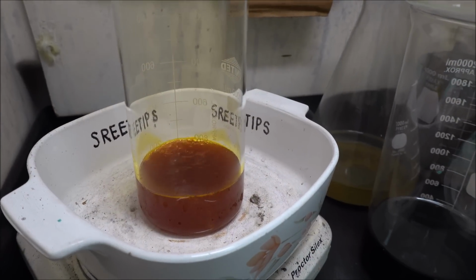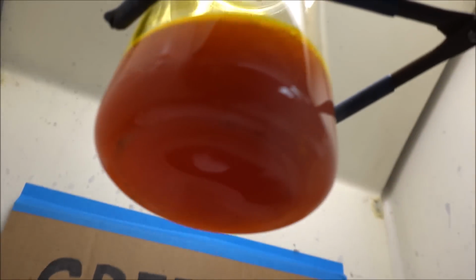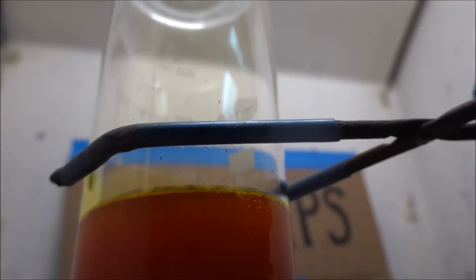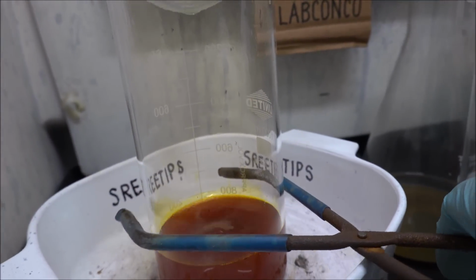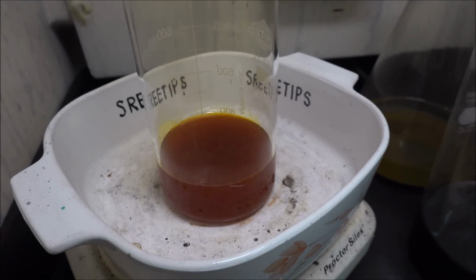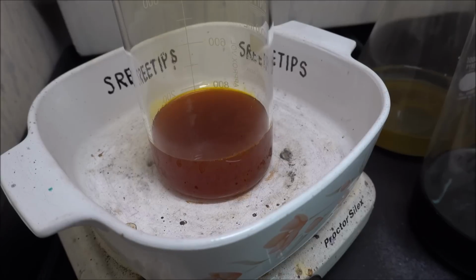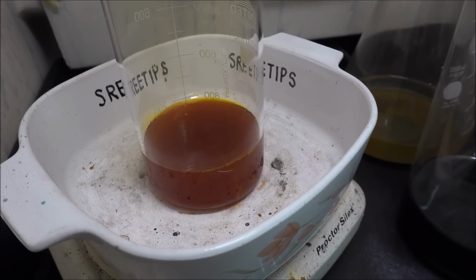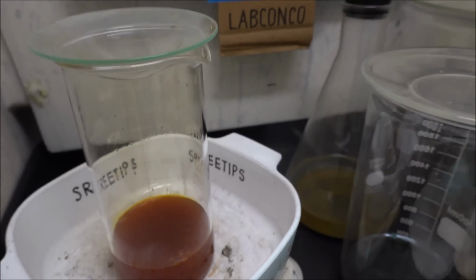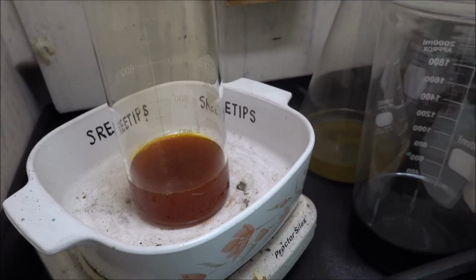This has been on here now for about 20 minutes, and as you can see here, we've got everything in solution. There's a few little tiny specks that remain in there, but I'm not going to go throwing a whole bunch of nitric in there. It might just be dirt, but we're going to go ahead and pull this off the heat now and let it start cooling down so we can get a precipitation.